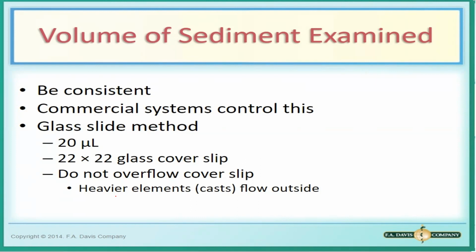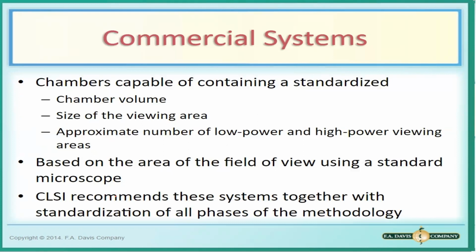Parang iisang layer lang yung mga cells, mas madali mong mabibilang. Just make sure lang na malinis yung cover slip ninyo kasi kung hindi, makakahinder lang yun sa vision ninyo.